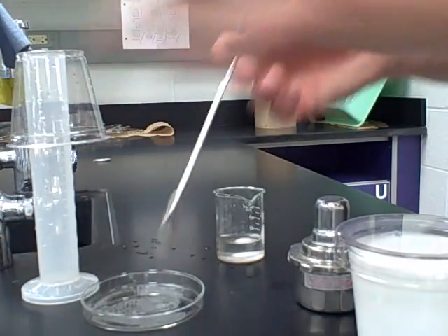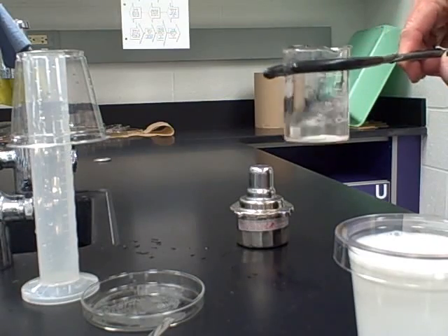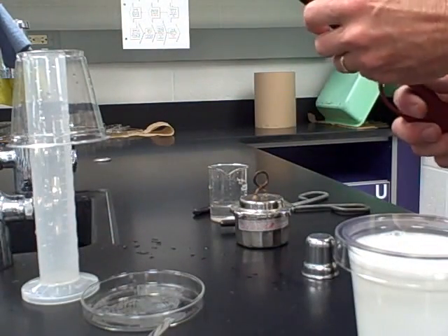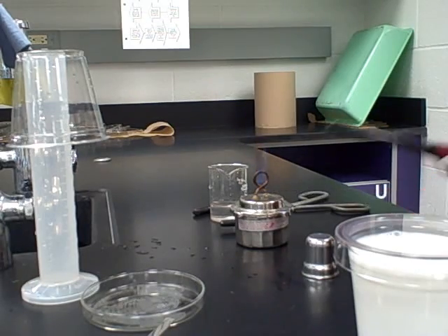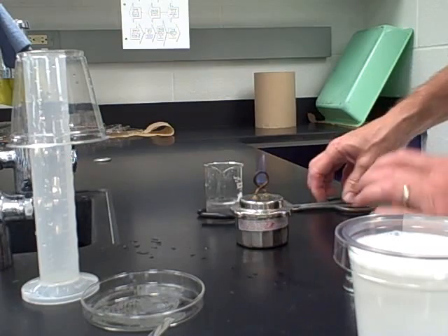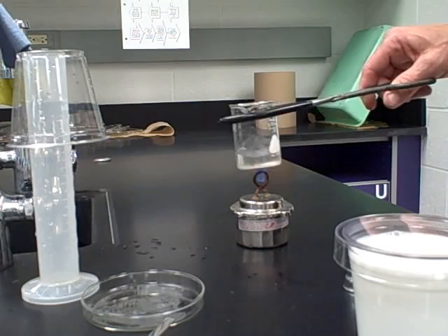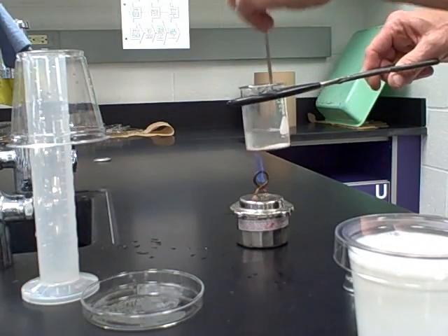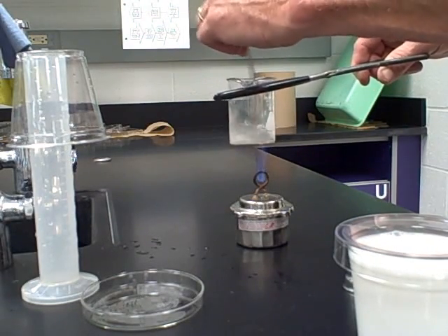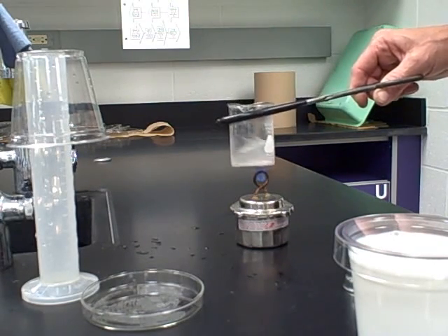Step two: using the tongs, hold the beaker and dissolve the borax into the water. We light our alcohol burner, hold the beaker up near the rim, place it over the flame, and swirl it periodically with the micro spatula, breaking up the chunks of the borax solution and swirling until it is all dissolved.